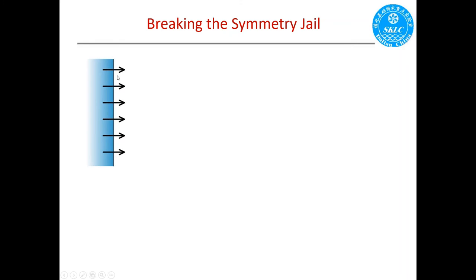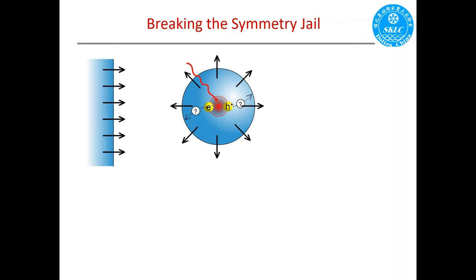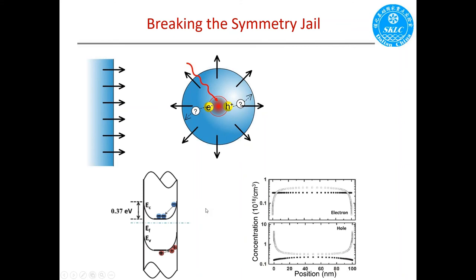So the topic today is that if you have this photocatalyst with finite structures, something like a particle, it will form this very famous U-shaped band bending in the semiconductor physics. If you have this U-shaped band bending, something like 0.37 eV, it will totally block the transfer of electrons from the bulk to the surface for an n-type semiconductor. According to a calculation, the amount of holes on the surface is at least two orders of magnitude more than the electrons.